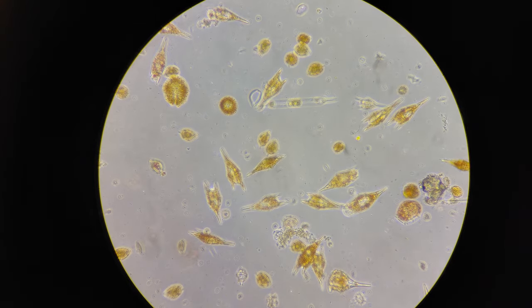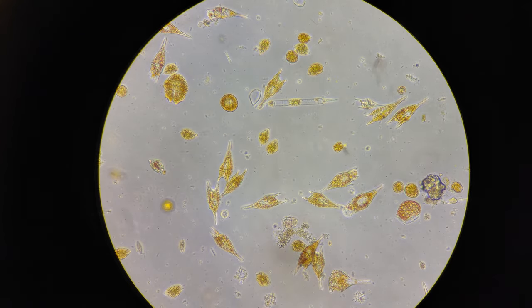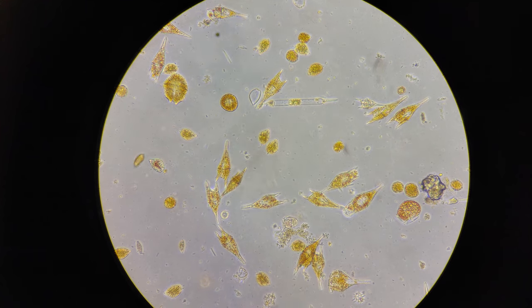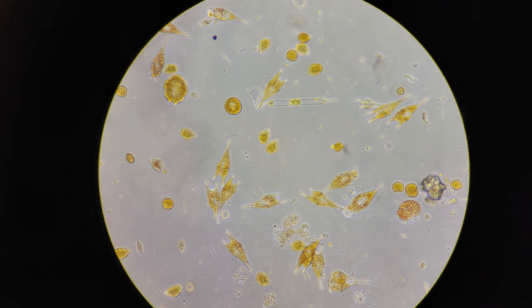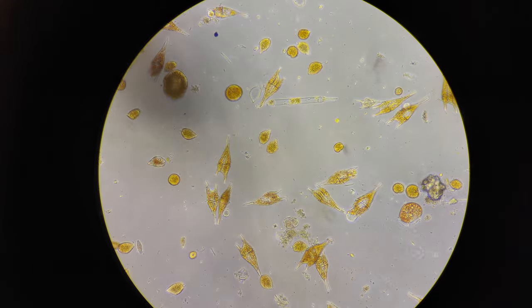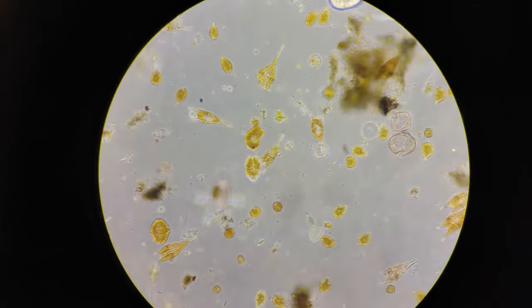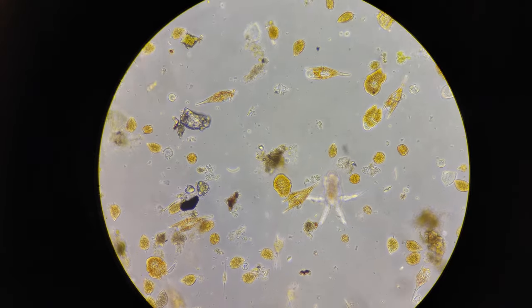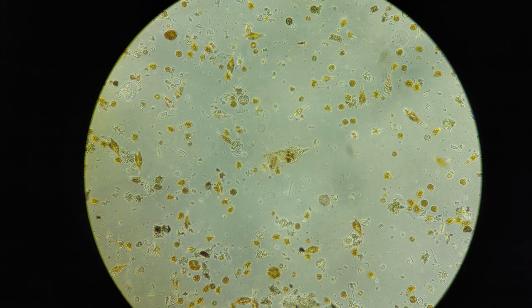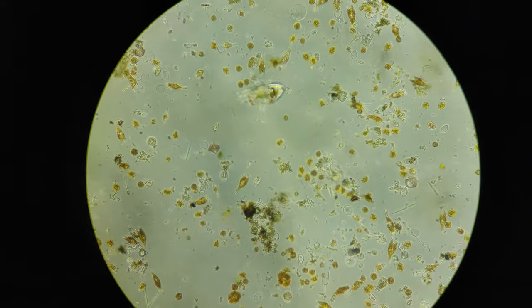This sample has a lot of dinoflagellates — they're the three-pronged ones in the center and also that larger circular one at the top left. Dinoflagellates are mostly photosynthetic, though some are mixotrophic, meaning they're both photosynthetic and heterotrophic, getting energy from eating food. And as the name suggests, they have flagella which are little tails they use to propel themselves. You can see that on some of them if you look closely. Dinoflagellates are really interesting and probably deserve their own video. When conditions are right — warm water or lots of available nutrients — they have a population explosion called a bloom. You've probably seen the glowing blue waves; that bioluminescence is caused by a type of dinoflagellate.